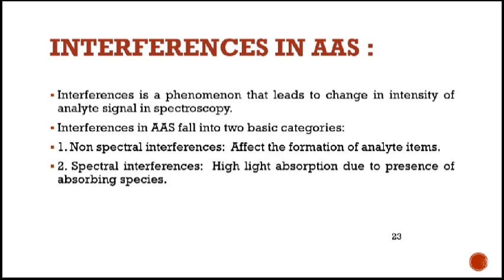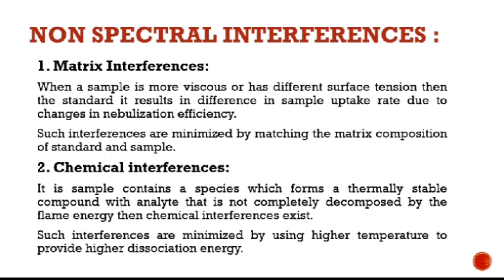Non-spectral interferences. First, matrix interferences. When a sample is more viscous or has a different surface tension than the standard, it results in a difference in sample uptake rate due to changes in nebulization efficiency. Such interferences are minimized by matching the matrix composition of standard and sample.